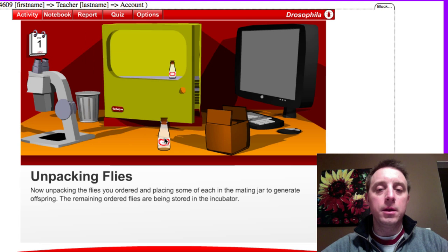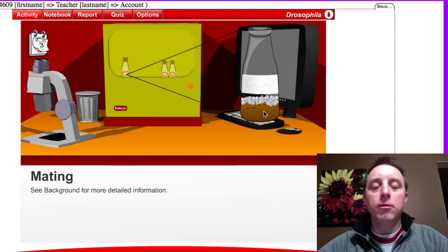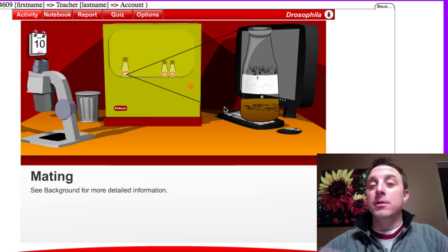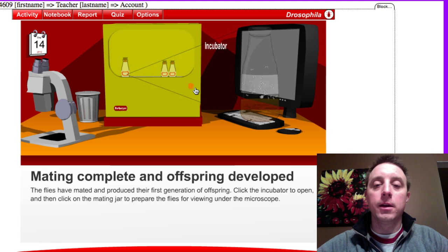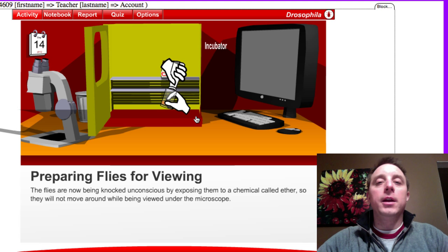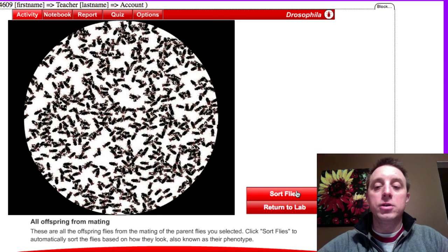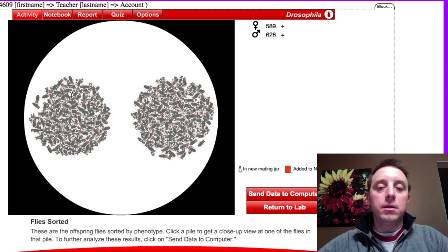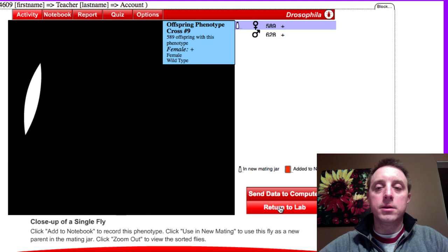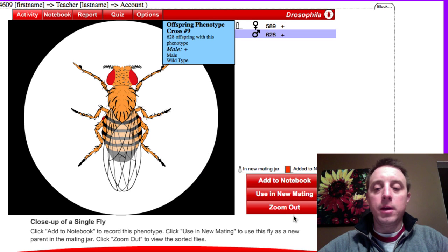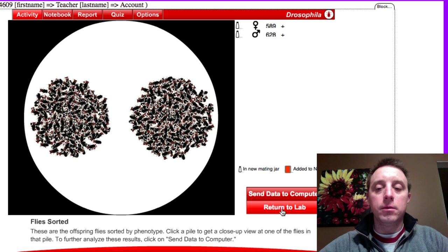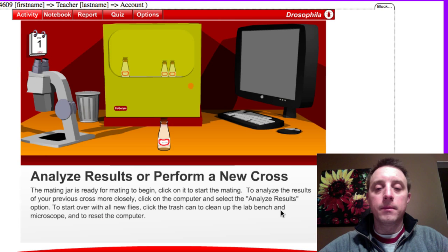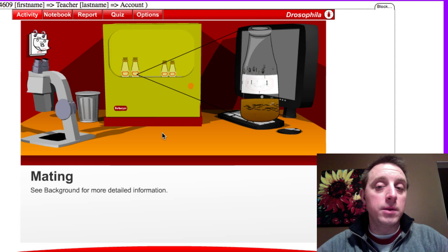We will check out. Yes, we really want to order them. Here they are. Unpack them, they go into the new mating jar, into the incubator. Wait two weeks. You can kind of get an idea of why I like doing this lab online and not actually ordering the flies, because all of these two-week waiting periods would really take a long time to do this. Let's take a look at our results here. If we think of this as the F1 cross for our dihybrid, you can kind of get an idea of what we should be seeing. We see everybody's wild type. What I'm going to do is just grab these and add them to a new mating jar. There's the female, let's grab a male, put him in a mating jar, and go back to the lab.